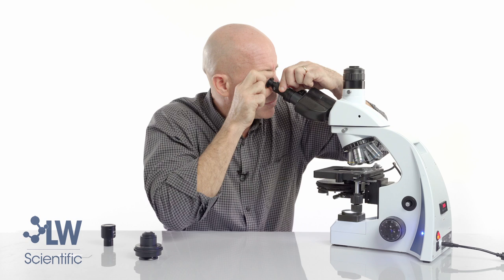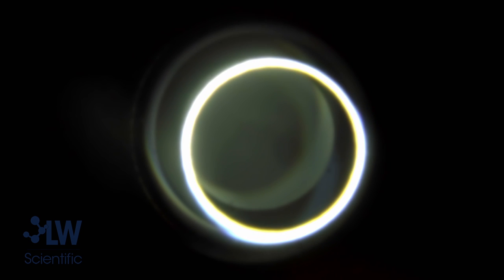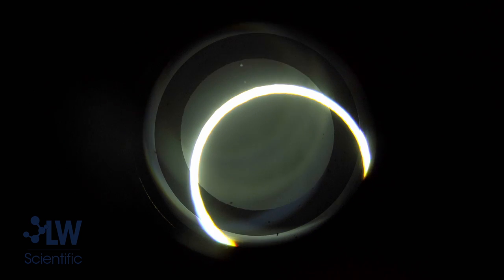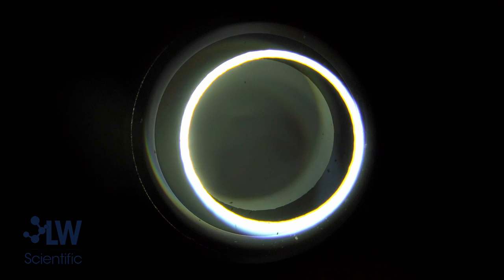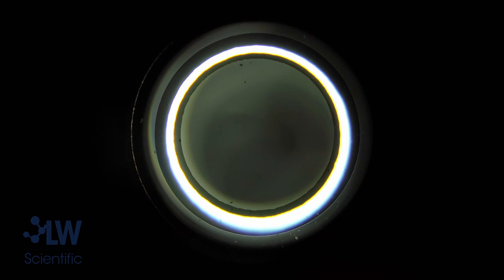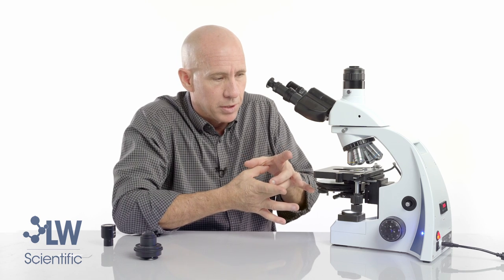You can zoom out to where you see that light halo very distinctly. There may be other scattered rings of light — just ignore those. Using the alignment wheels, you can see the halo moving as I move it around left and right, up and down. You are essentially lining up the halo underneath the dark donut.